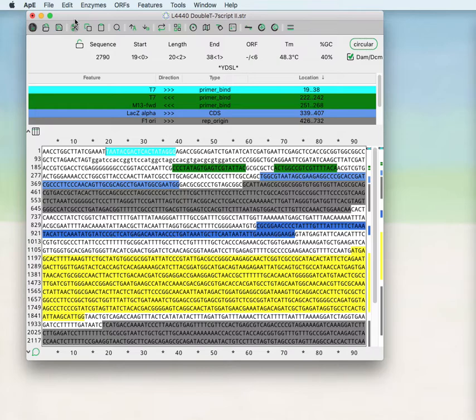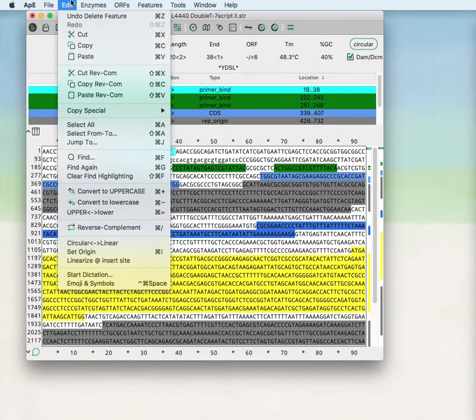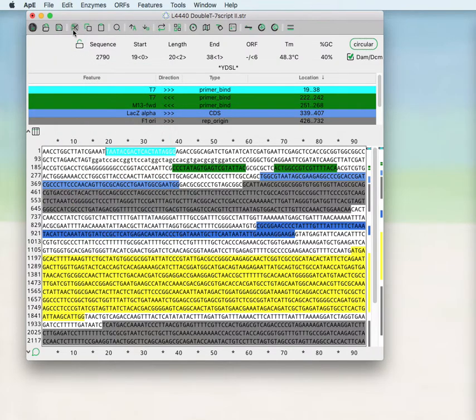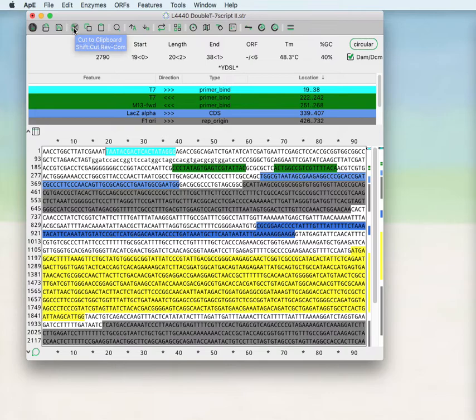These functions are available both from the main menu and from the toolbar where holding down the shift key while clicking on the toolbar will do the reverse complement function of the cut, copy, and paste.